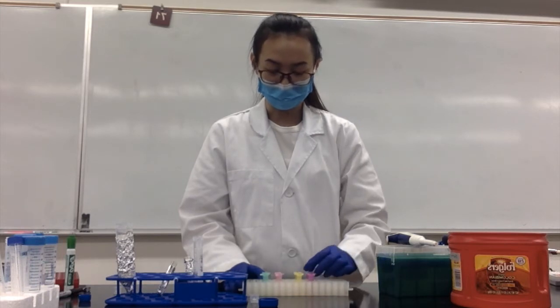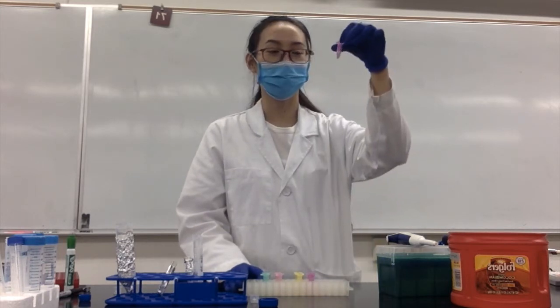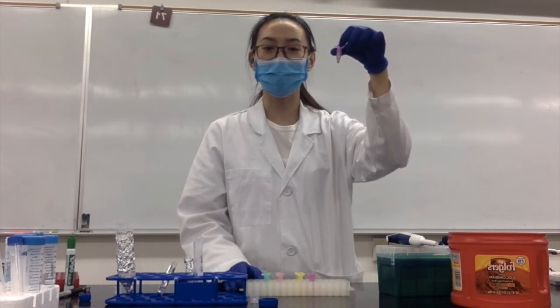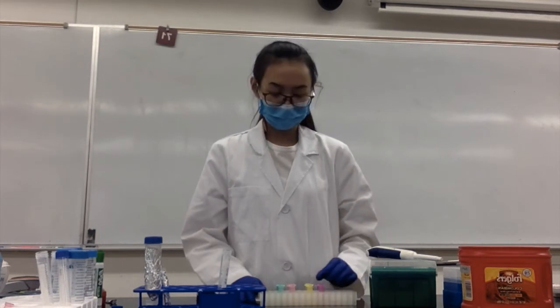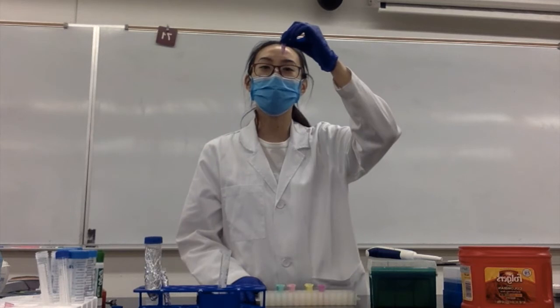For this video, I'll just choose one NTC tube as an example to show you how to do ROS measurement. I've already spun these samples for five minutes at 2,000 rpm. After centrifugation, you should see a cell pellet at the bottom of each tube.